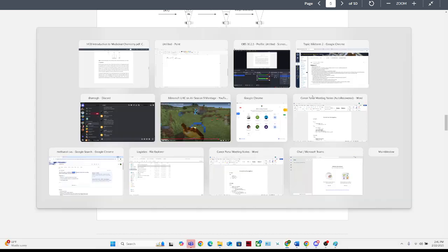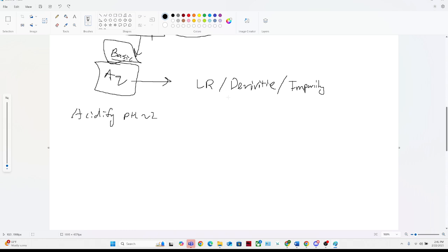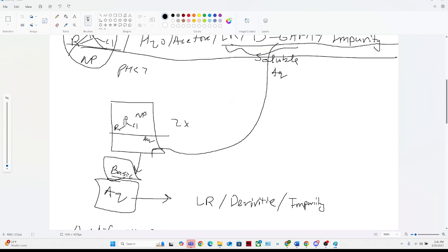There are 2 reasons why you want it to be cold. One, to manage kinetics, right? You want to ensure that you don't get hydrolysis. If I drop the temperature, the odds of hydrolysis happening on my derivative are lower, as opposed to doing it at room temperature, which we did in the first workup.